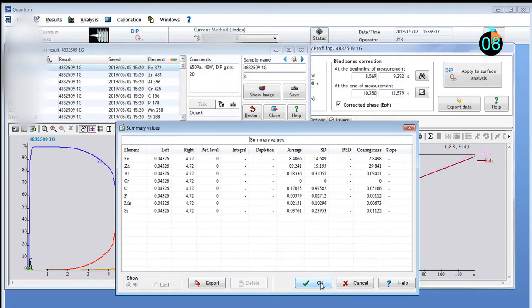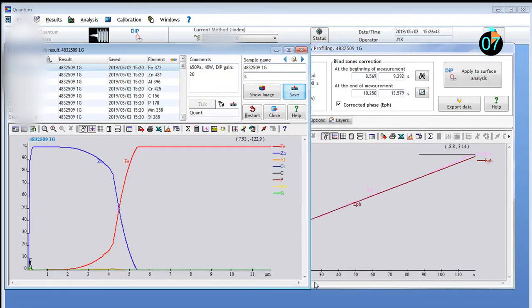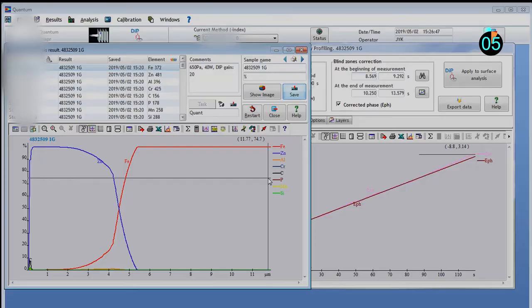Elemental depth profiling is made easy with Hariba's GD Profiler 2 and Quantum.